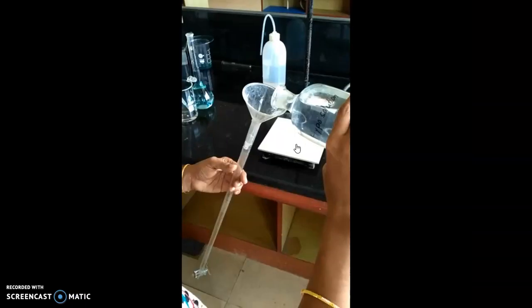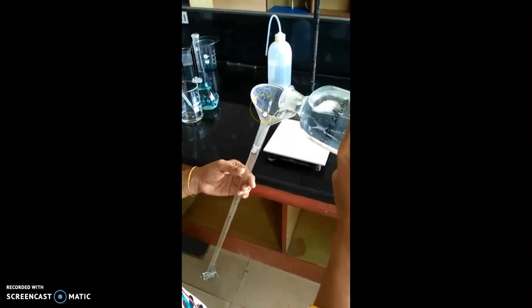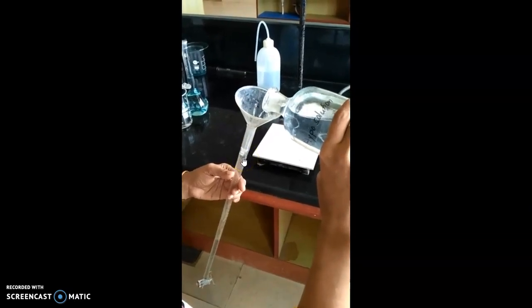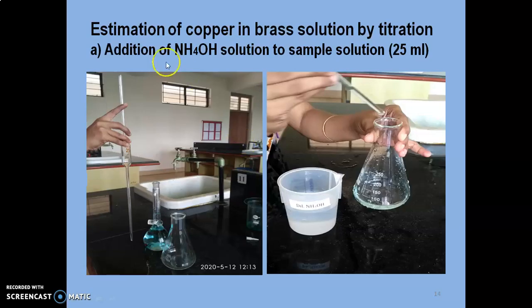The addition of hypo can be done through the funnel, and the initial reading has to be noted. 25 ml of standard brass solution has to be pipetted into a clean conical flask. To it, NH4OH is added to neutralize the nitric acid.